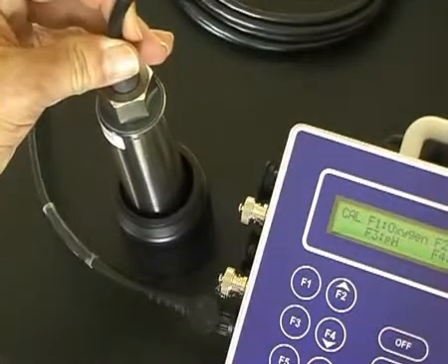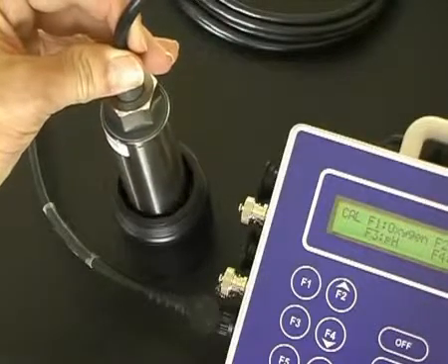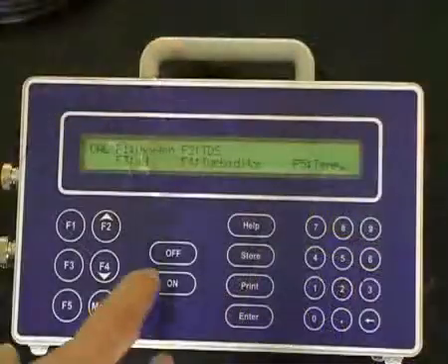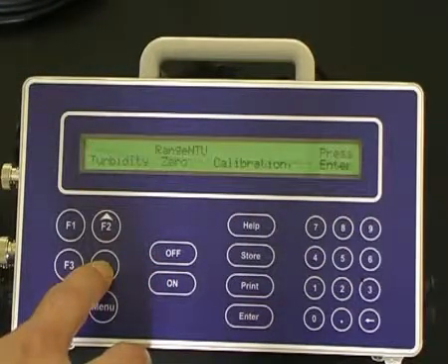Allow sufficient space underneath—30 millimeters—and around the sides. Once the sensor has equilibrated, press F4 for turbidity. Allow the sensor to equilibrate to the value, then press enter to calibrate.